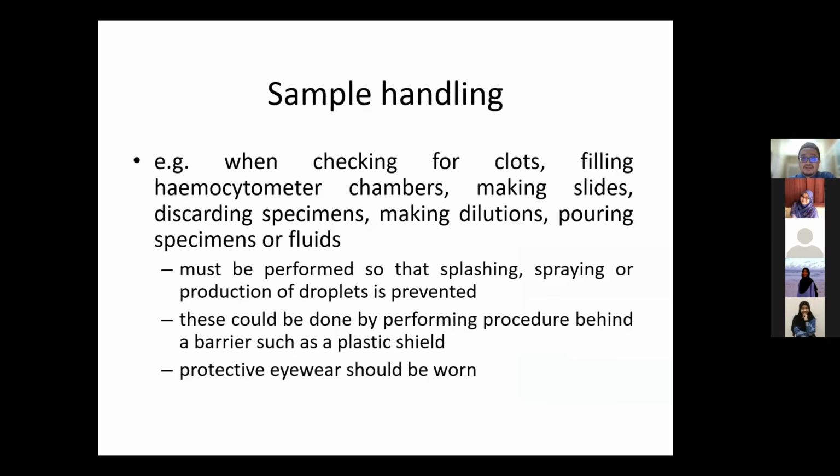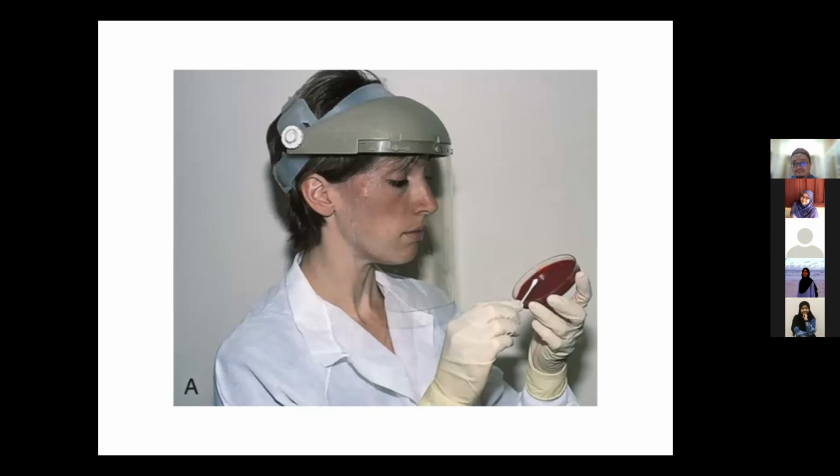This is an example. A few years ago when I showed this, people might find that this is a bit extreme. Wearing a face shield like this. But today it is becoming a norm, especially after COVID-19. People even wear things like this on the street, in the shop, in restaurants, they wear this kind of mask.